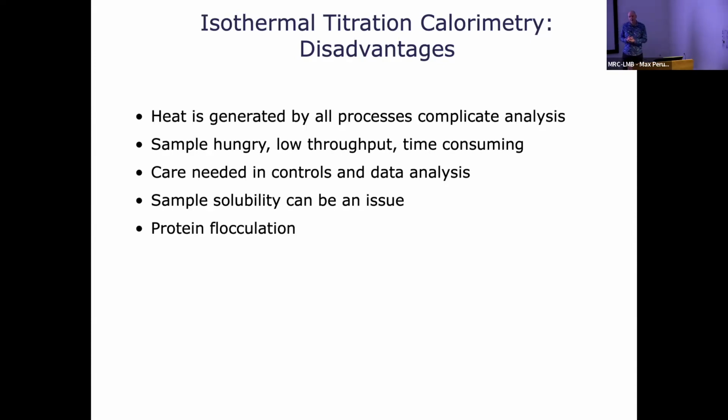Some proteins don't like being stirred. You've purified them, you've got them quite nice. You put them into the cell, and of course, during the reaction there's a spinner spinning around, and then you come to the end and go, why is my trace very horrible? You take the sample out, you can kind of see it's just aggregated.